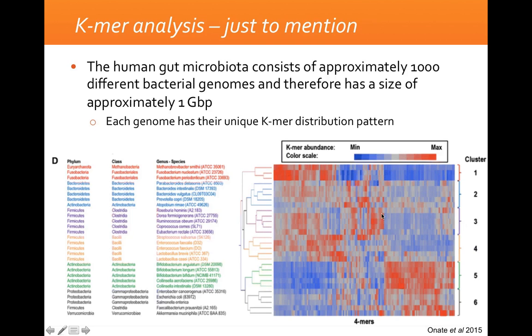It's possible to do this Kmer analysis on complete genomes and even on metagenomes, to look at the distribution of species in your sample.